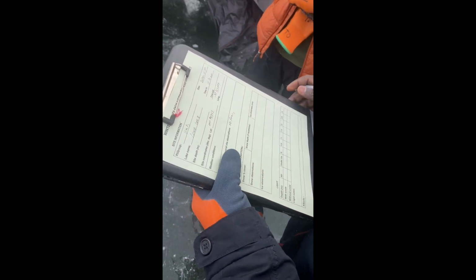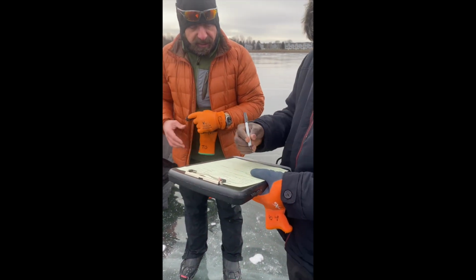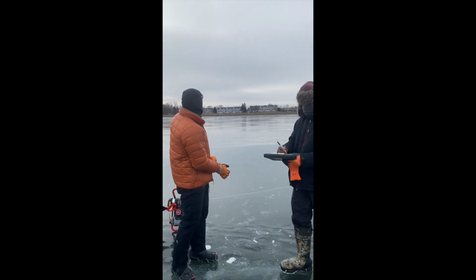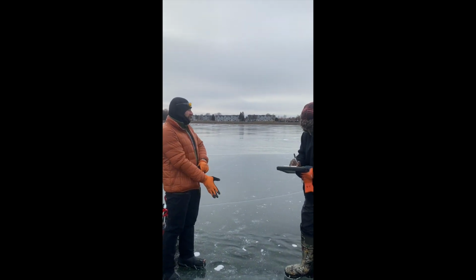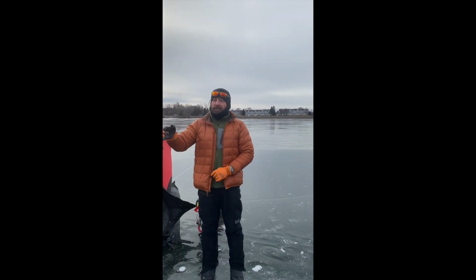Okay, we'll record site depth in a second, but in the meantime, we'll record some weather conditions. So mostly cloudy. It's about -7 degrees Celsius. There's a light wind from the north.